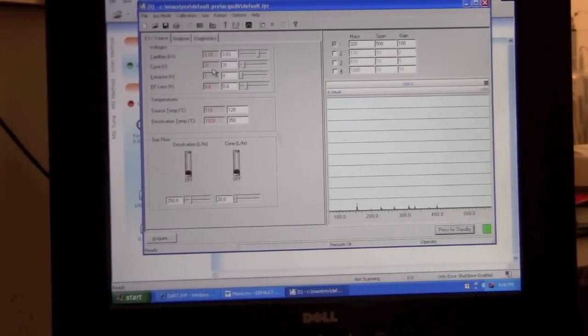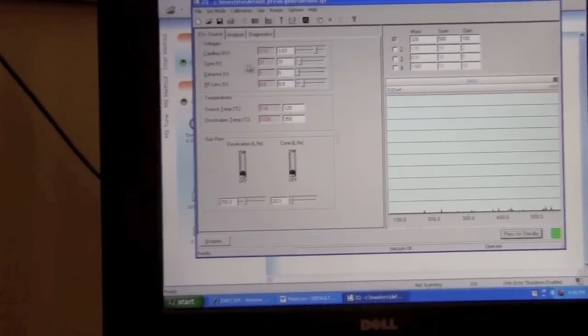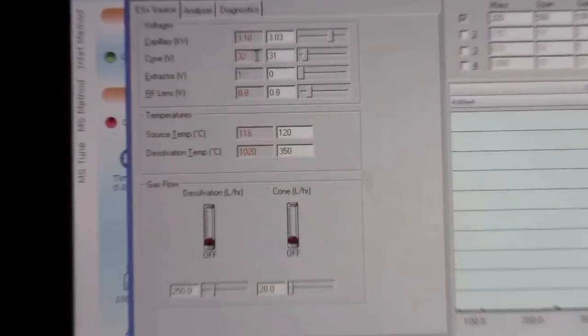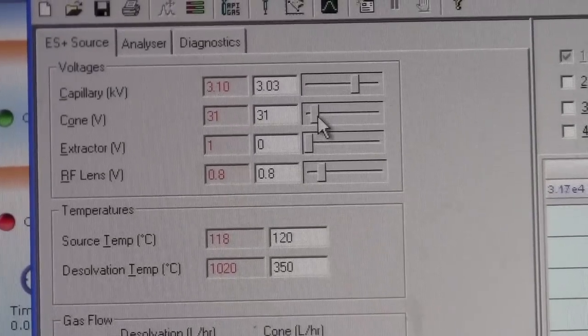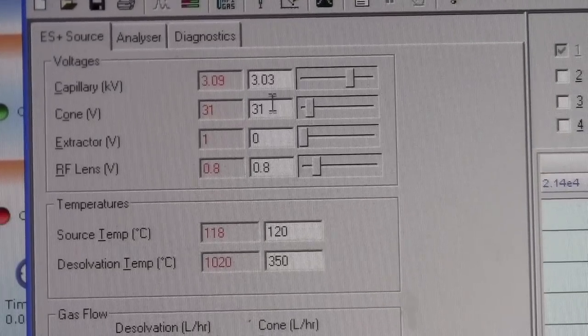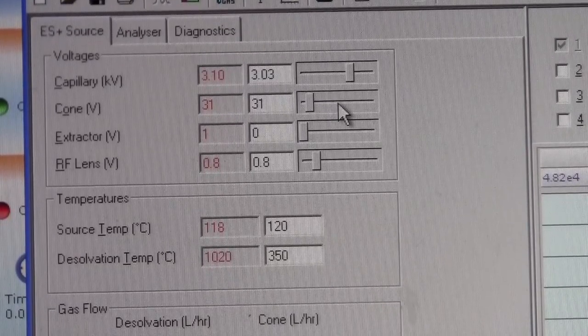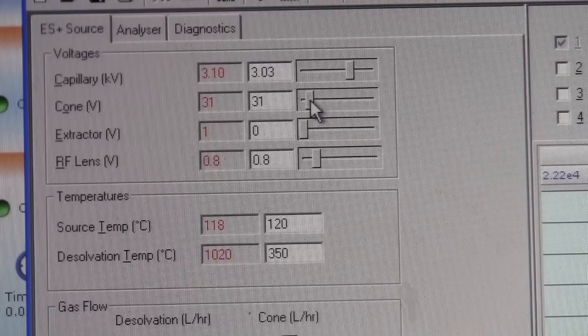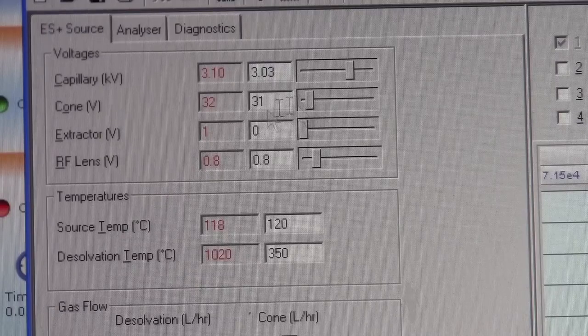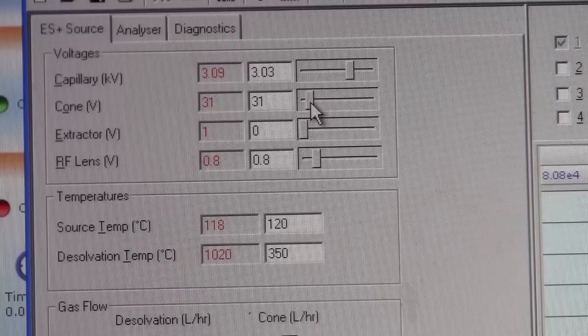The main setting that we want to adjust on this page is the cone voltage. The optimal setting will depend on your sample. Higher is better for some samples, lower is better for others. I'm going to leave it about 30 volts right now.